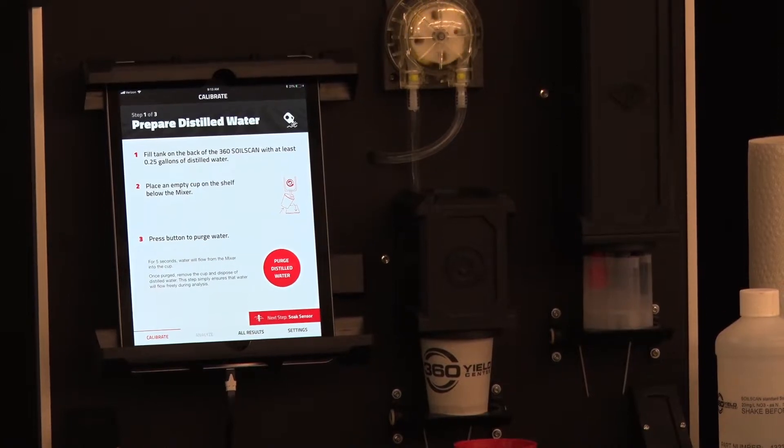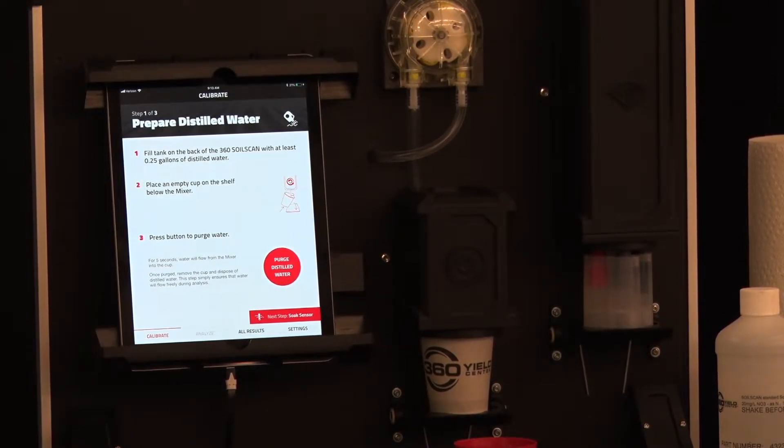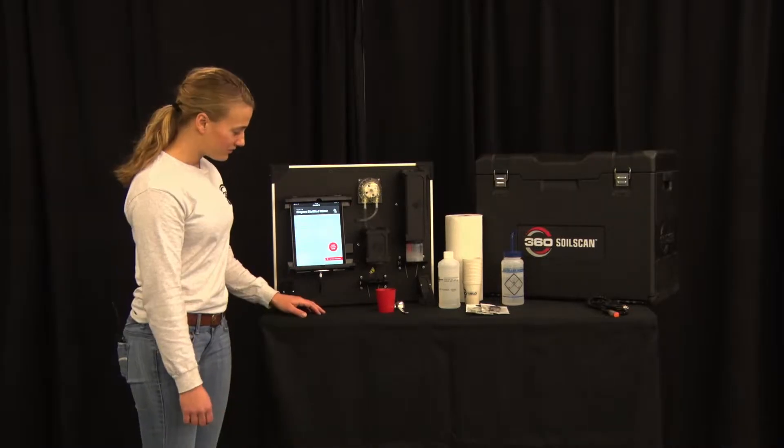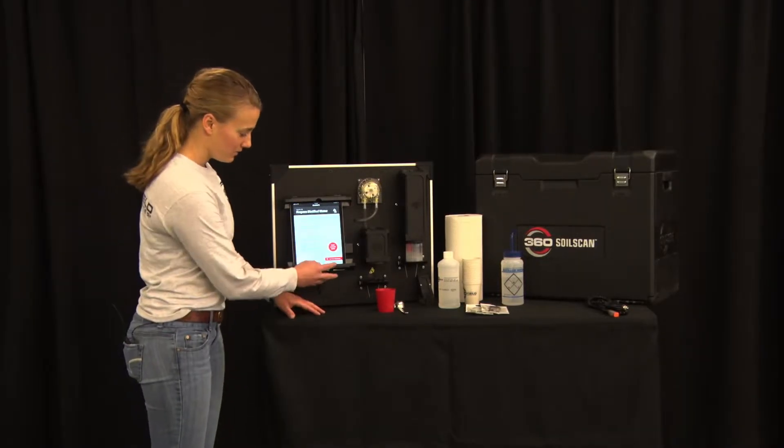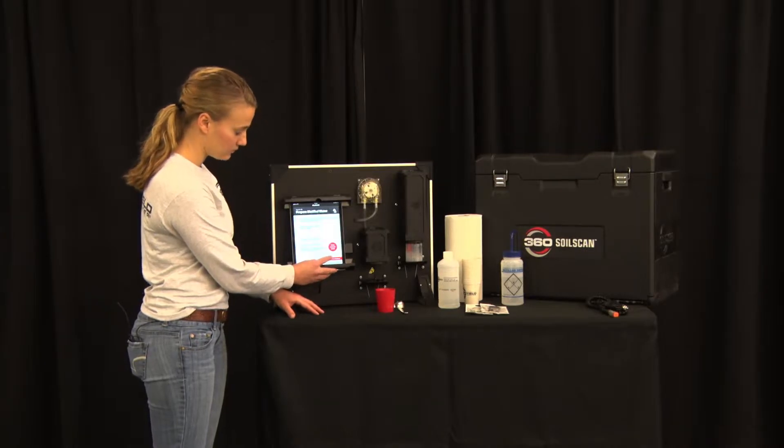The system will run allowing distilled water to run throughout it. The SoilScan app provides step-by-step instructions. Simply follow the on-screen instructions. After purging the water we are soaking our sensors. So just select soak sensors.